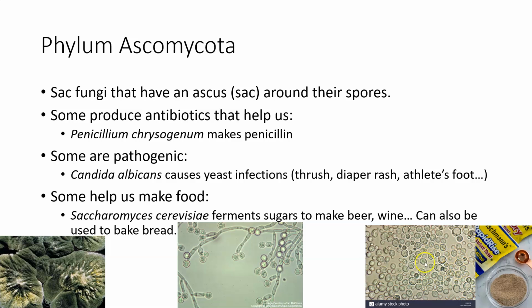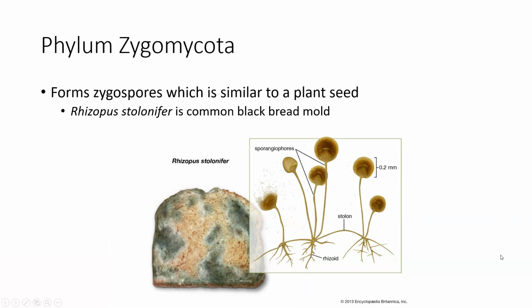It is a unicellular yeast, unlike these other two, which were multicellular. Then, for Rhizopus, I recommend you draw the Bob Ross for Rhizopus, because this is usually what they show you a picture of. And it's usually pink because they will have stained it. This one looks a little bit different because the picture's not stained. But there is your little Bob Ross Rhizopus.